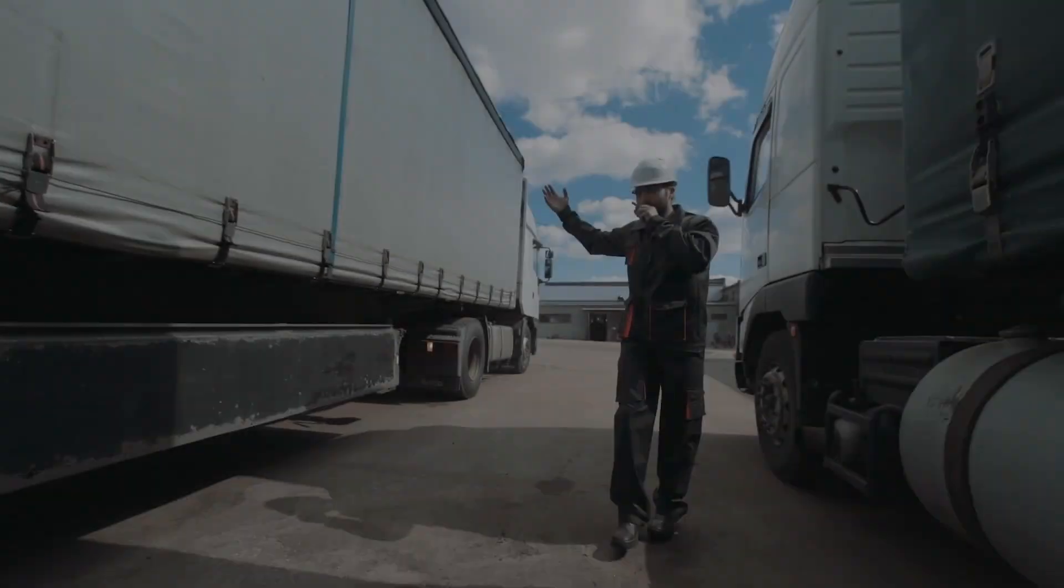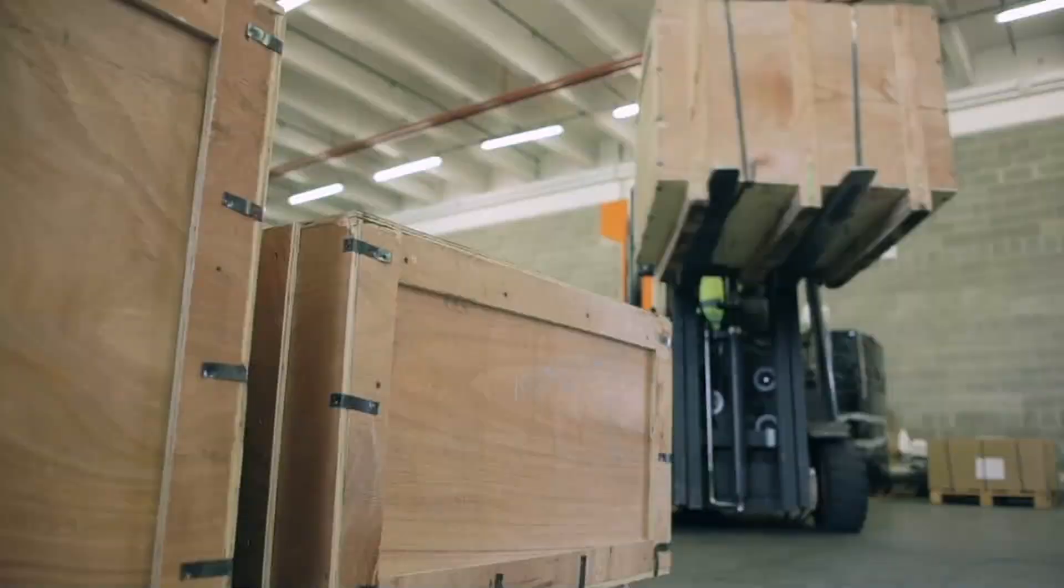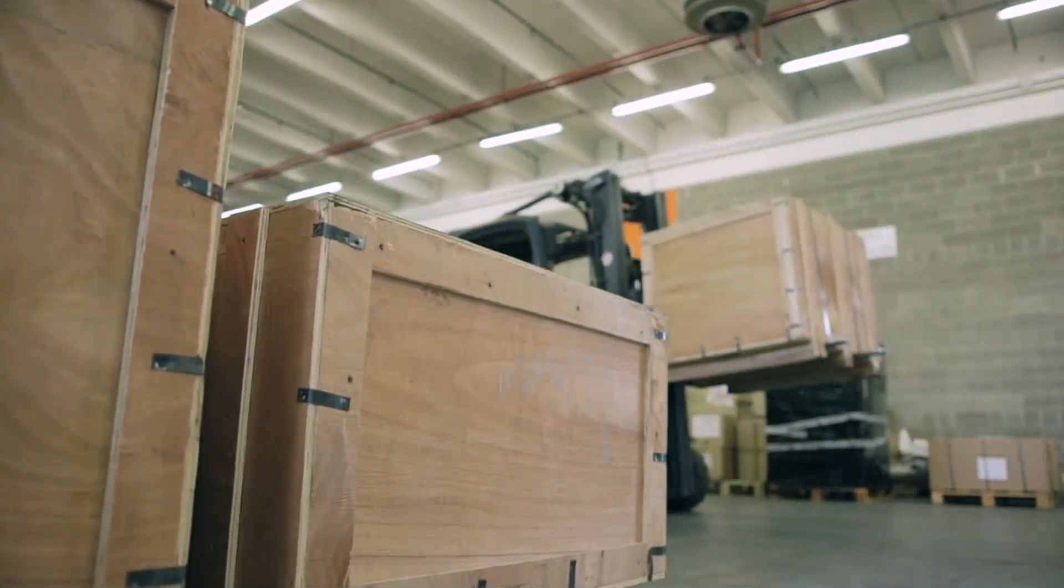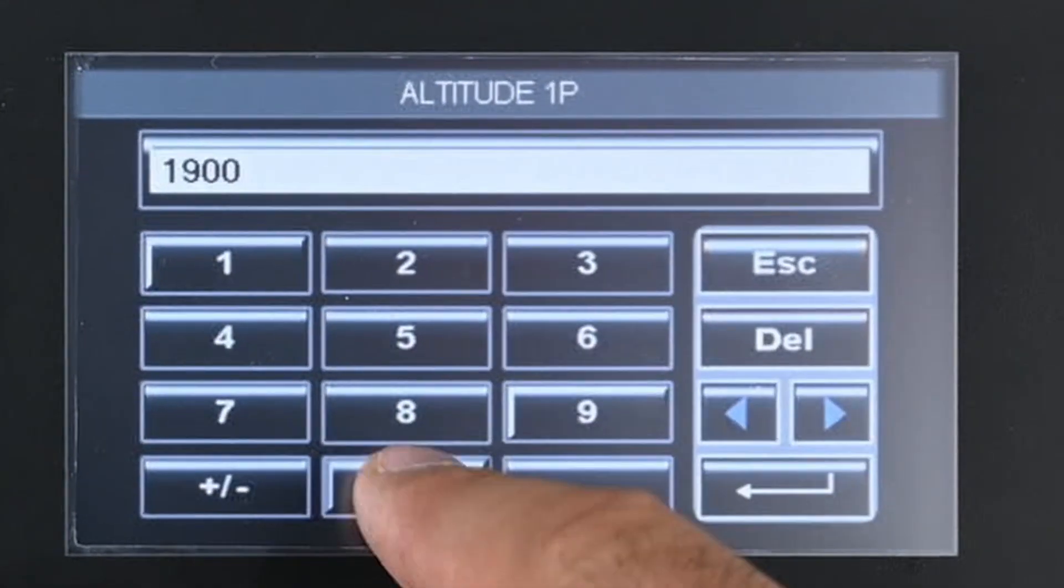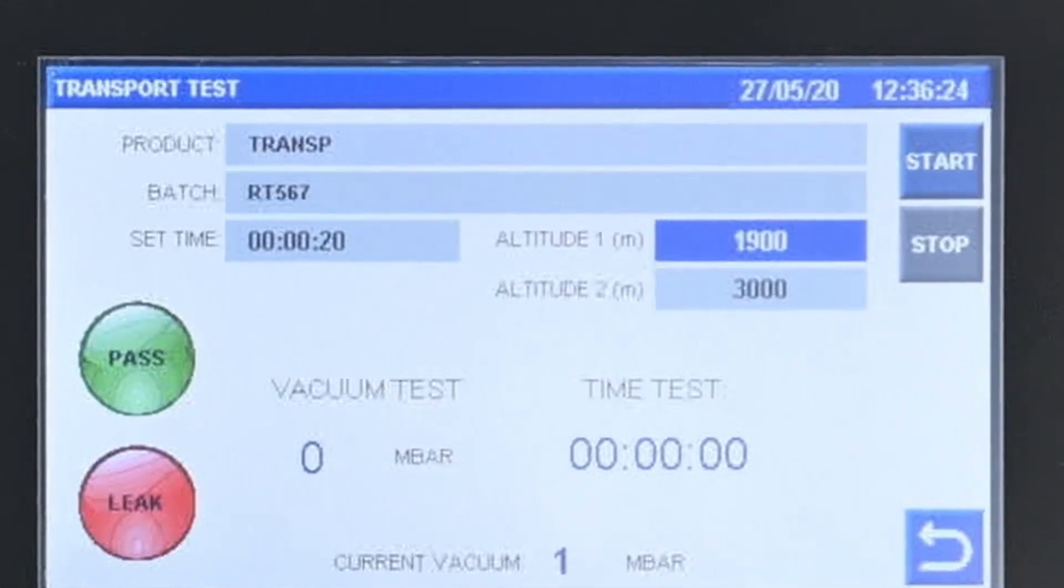Transportation Test will simulate the effects caused by changes in altitude during transportation of packages. Orion will automatically calculate the vacuum level necessary by entering the altitude of the destination and the location of packaging.